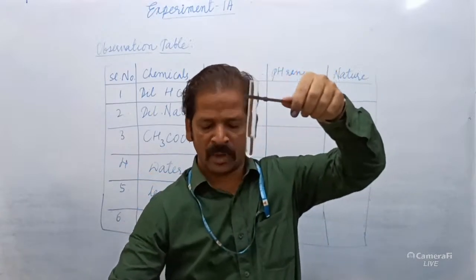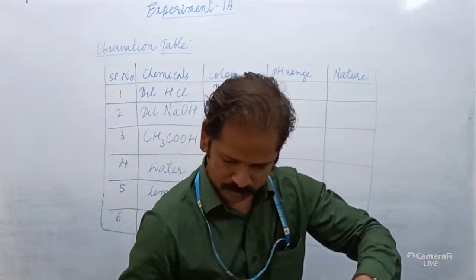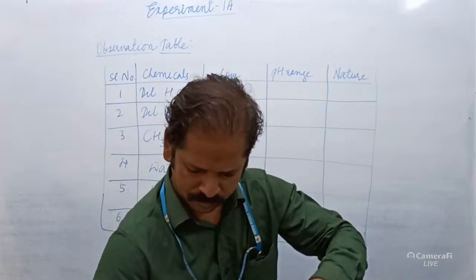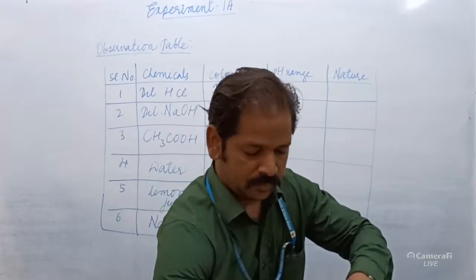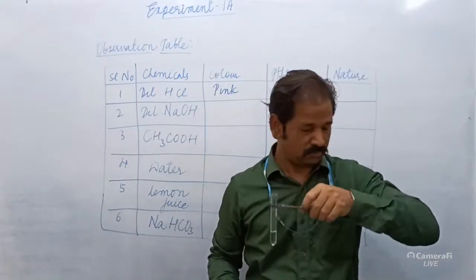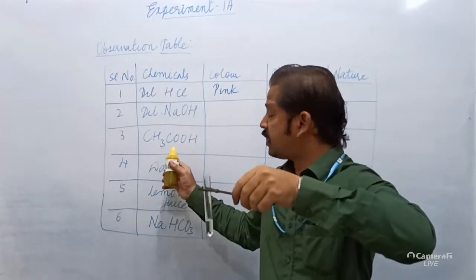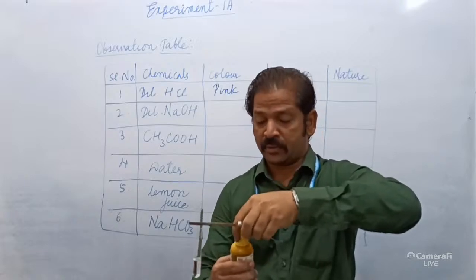Yes, 2 to 3 ml of acetic acid. Yes, it has an unpleasant smell. Okay, this is acetic acid. I will add the universal indicator to it.